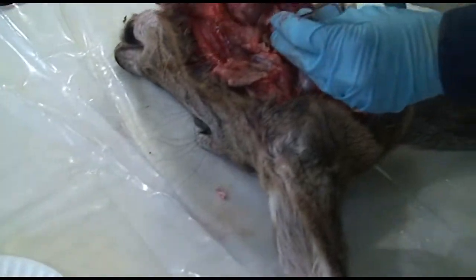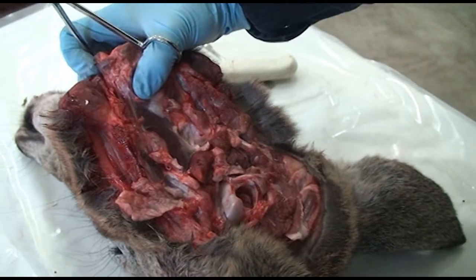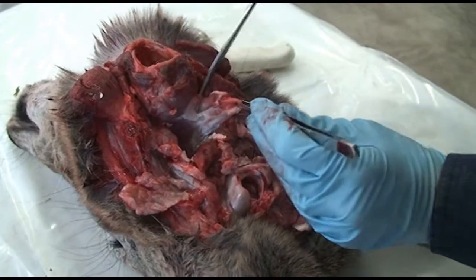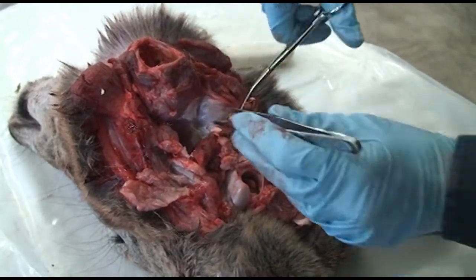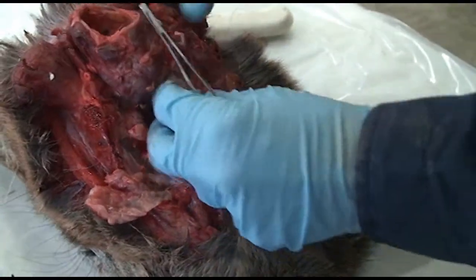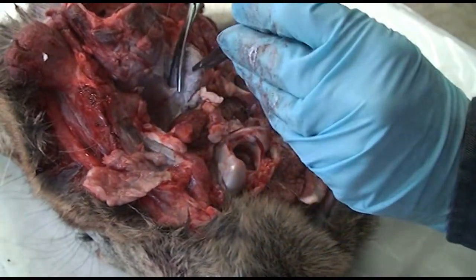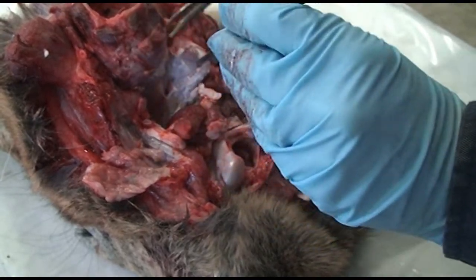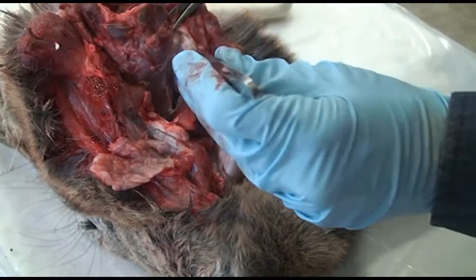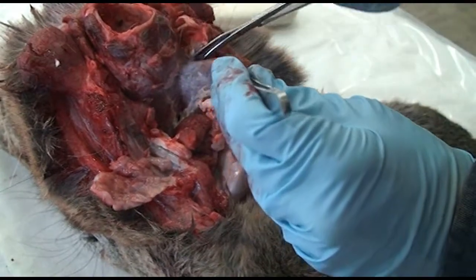The other thing to mention is that these lymph nodes can be several different shapes. That one was very typical, a kidney-shaped lymph node, but sometimes these lymph nodes can be even bilobed. I've seen them heart-shaped. They can be circular, just round, more like a sphere. And they can also be different sizes. If the deer has been sick or stressed at all, they can be enlarged and reactive.